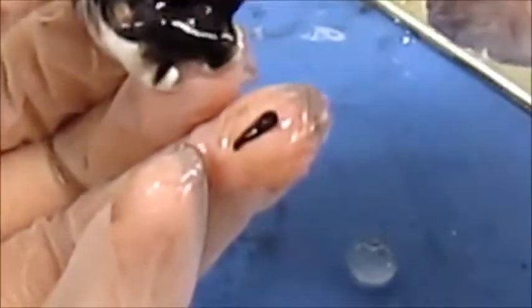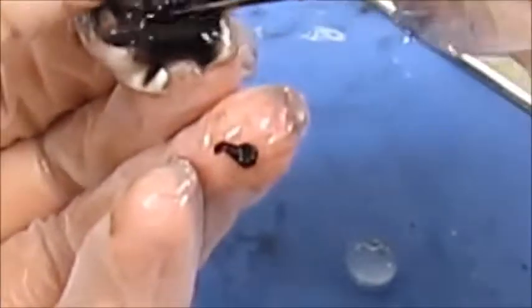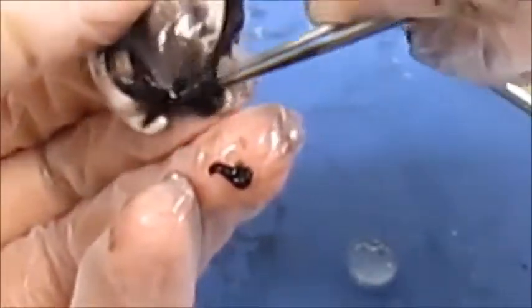To scrape the retina off, there is an iridescent blue surface called the tapetum. This reflects light back to the retina, but humans do not have this.